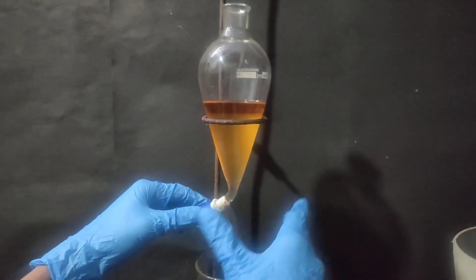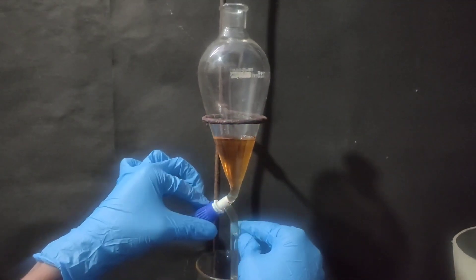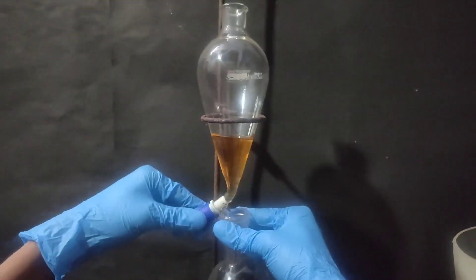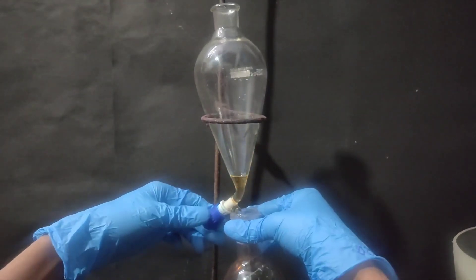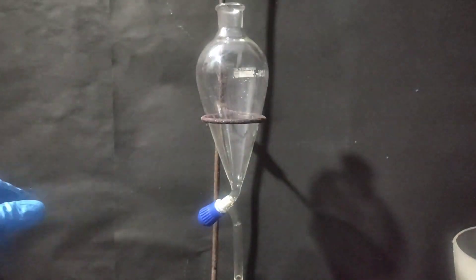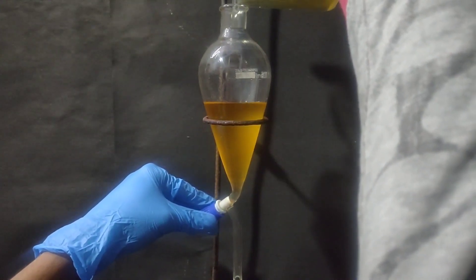The lower aqueous layer was drained. Then the upper ethereal layer was drained into a flask. Then the aqueous layer was again poured back into the separatory funnel for further extraction.